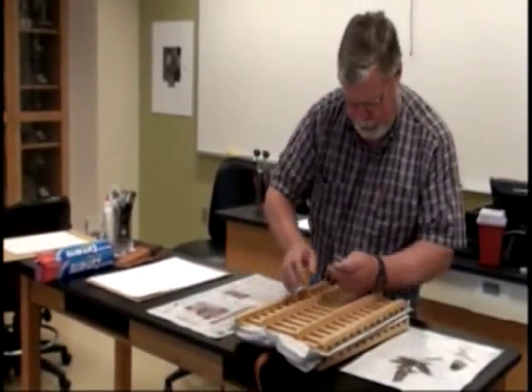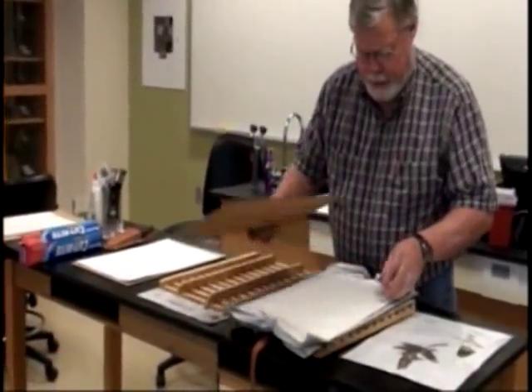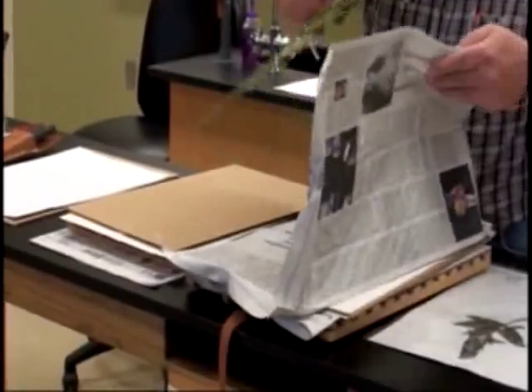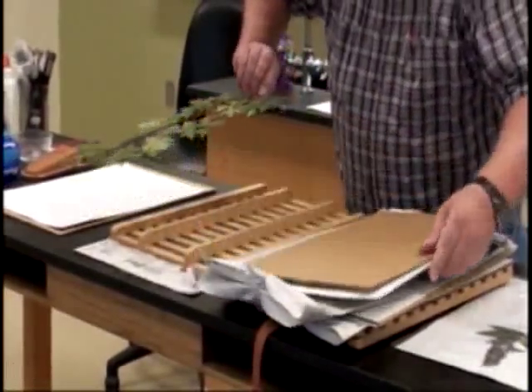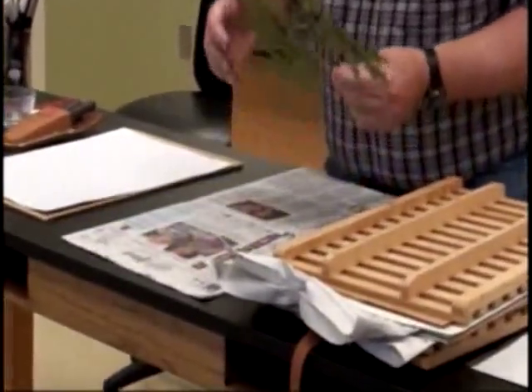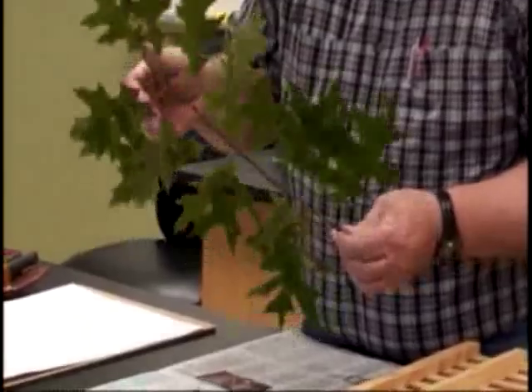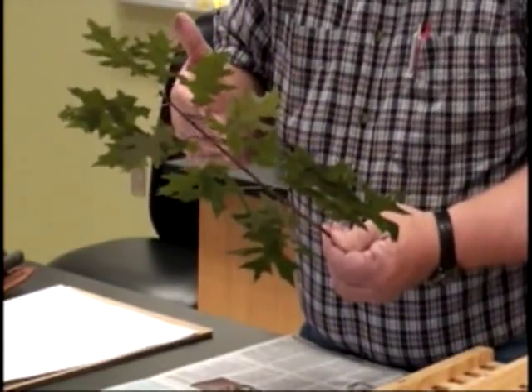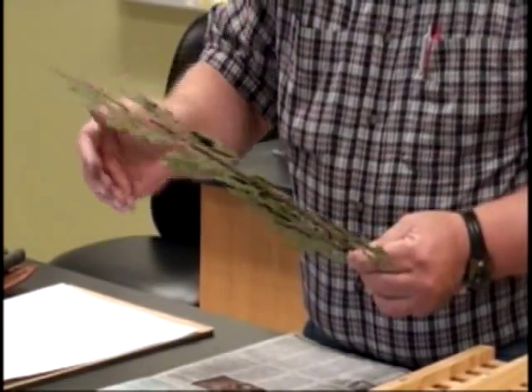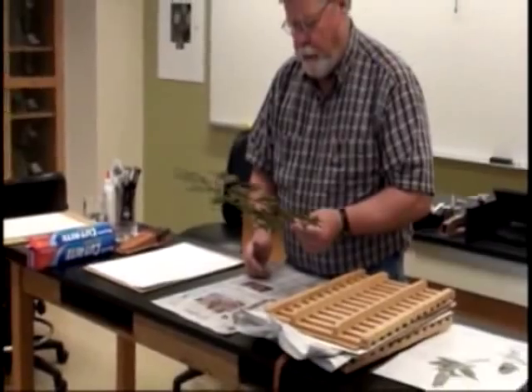We're going to undo our plant press. It's been a little over a week since we pressed this plant, and it should be nice and dry. This was the red oak that we pressed a week or so ago. You can see that it still maintains its green color. Some plants will lose their color during pressing, depending on the type of plant, the cell structure, and so forth. But oaks have densely packed cells, so they'll retain their green chlorophyll color quite a bit.